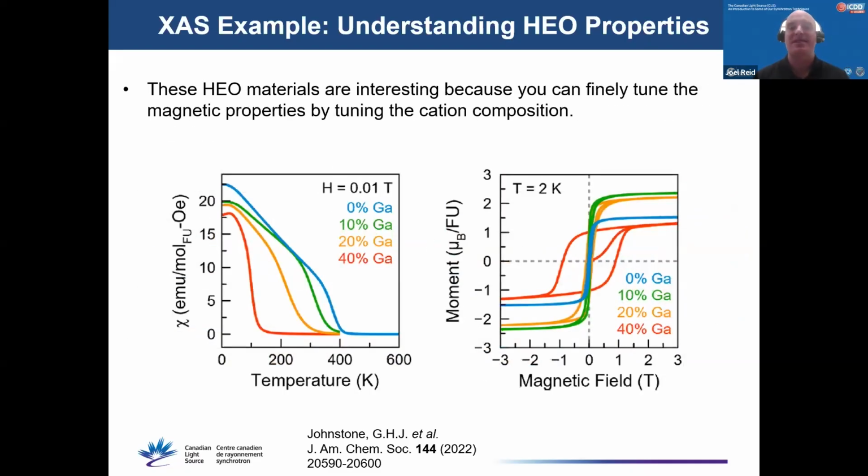What's interesting about this system is that you can tune the magnetic properties by controlling the amount of gallium in the material. You can see significant changes in the magnetic susceptibility and the magnetization curves here as a function of the gallium content.